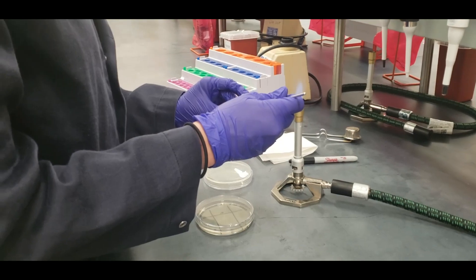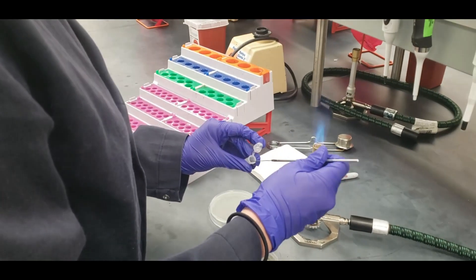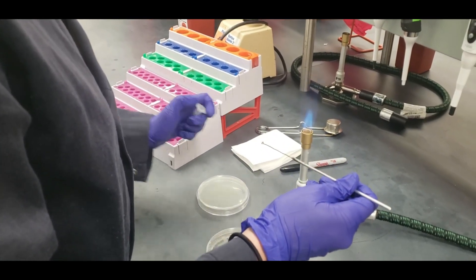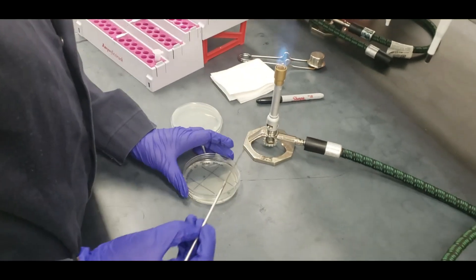You're going to stick your loop in your culture tube and you're going to streak all of quadrant one.